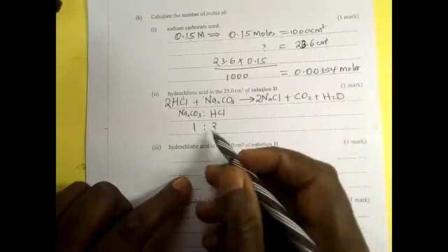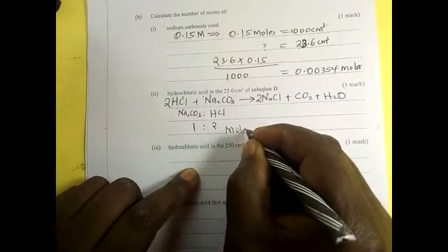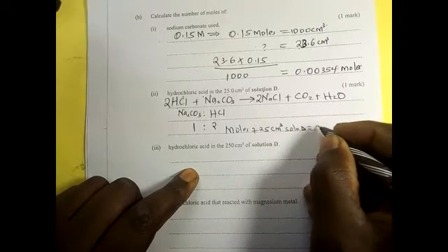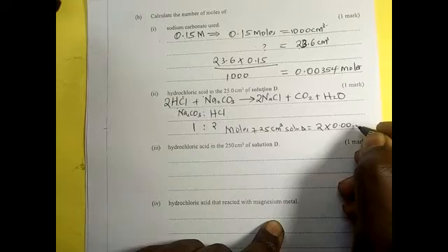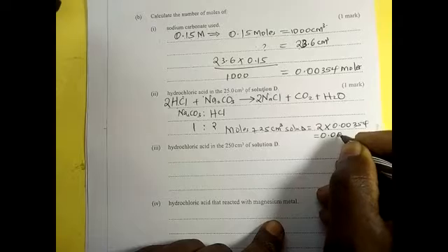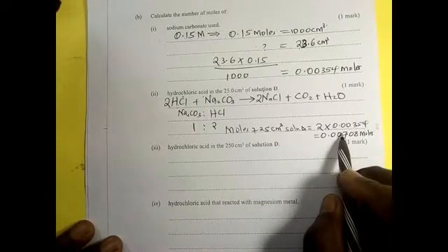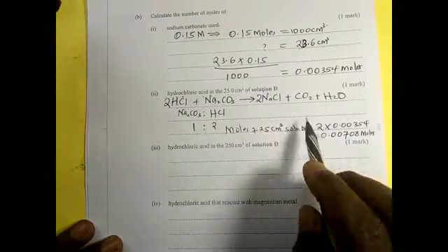So it means that the number of moles of HCl in 25 centimeters cube of solution D is equal to 2 times 0.00354, which will give us 0.00708 moles. That is the number of moles of HCl that reacted with the carbonate, because 25 was pipetted from solution D.